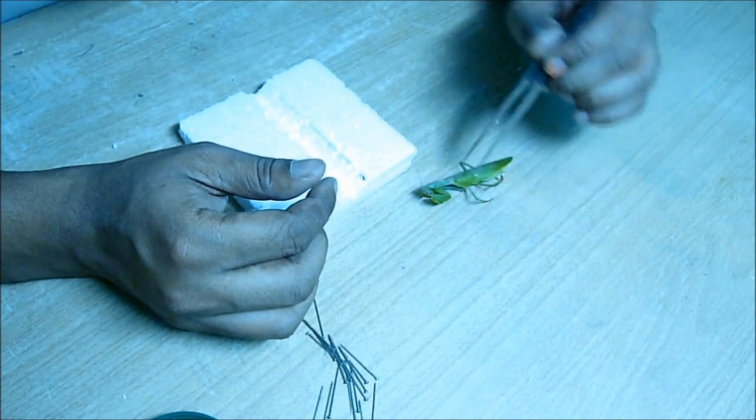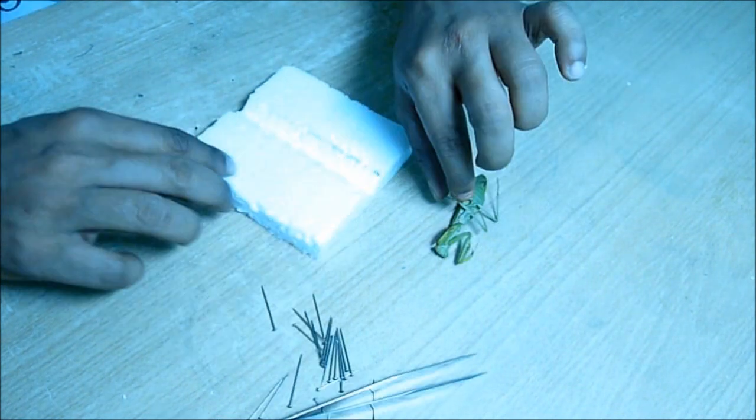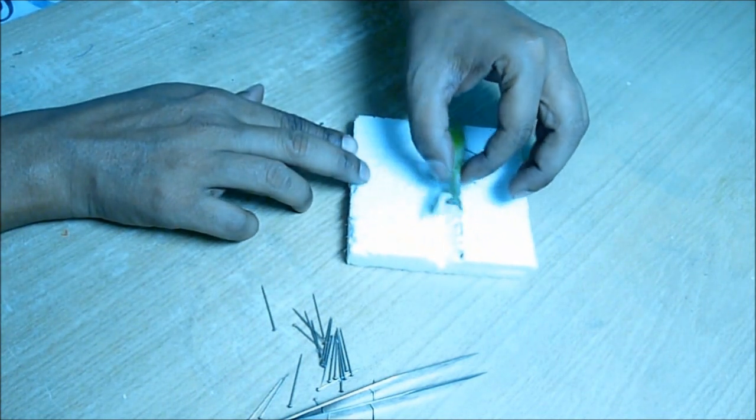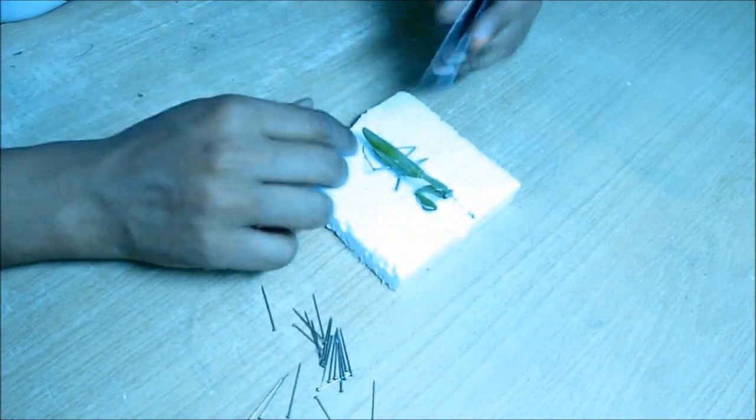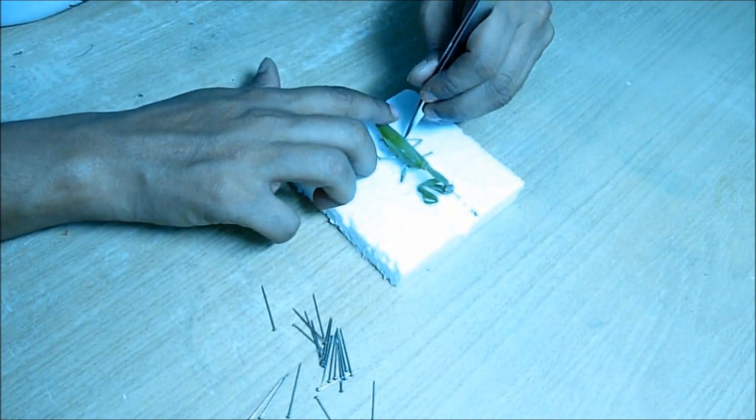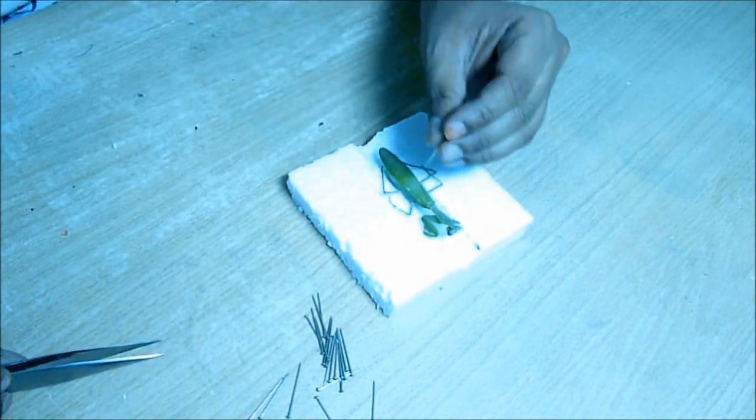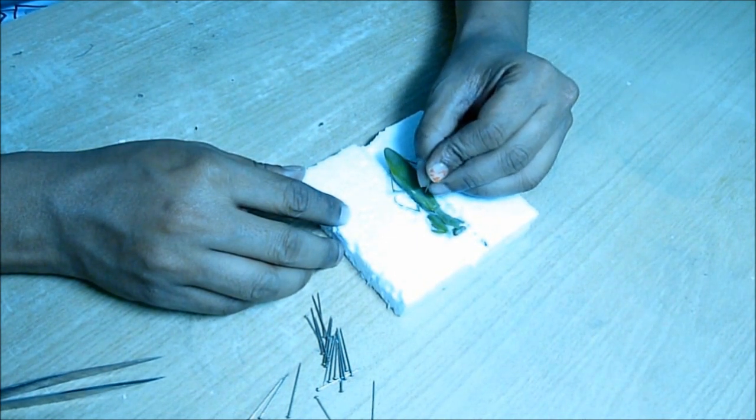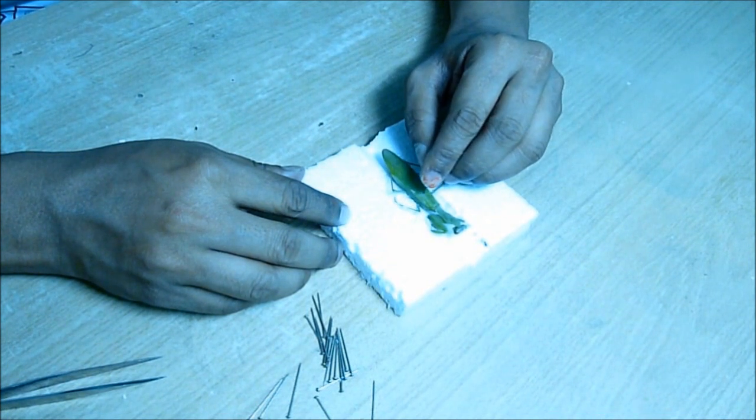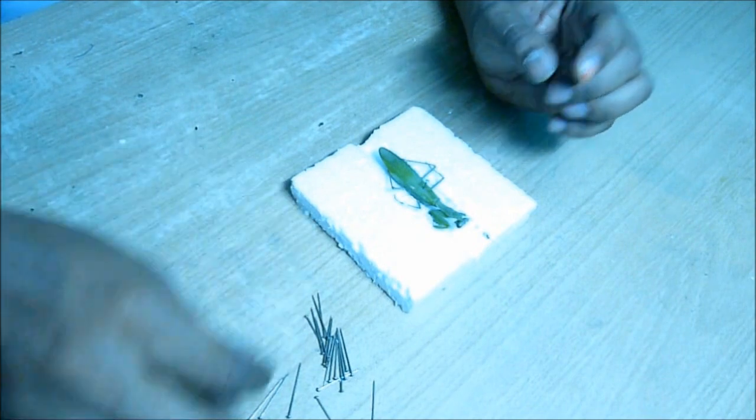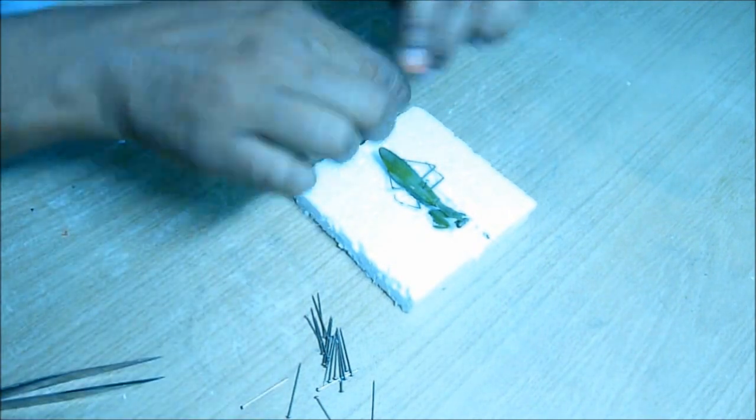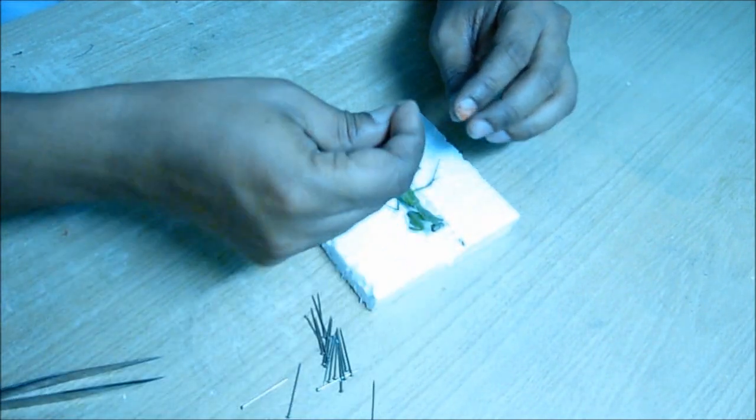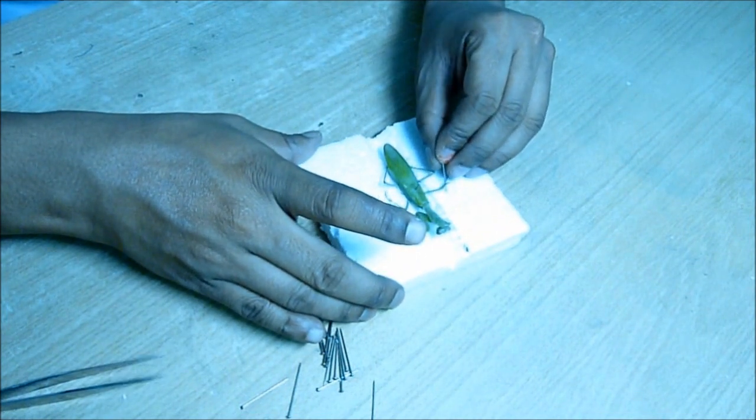With the help of a tweezer I placed this insect at the center of this trench. First I use a pin to prick through the body of the insect to the thermocol to fit that into the thermocol. Then I use other pins to give a proper shape by stretching the legs, all the six legs, and the antennas.